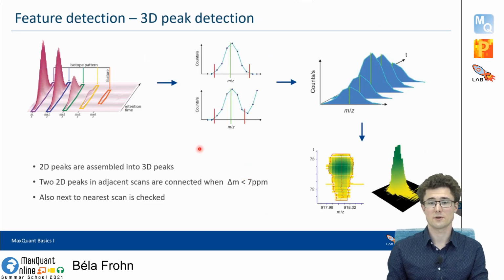So how does it work? This is what we get as input. And now as a first step, we want to find peaks on here, this mass to charge axis. So we have data points on this axis, and they describe something like a peak. And what we basically do is that we define some limits of this peak, which is either between the first 2 data points where one is 0 and the other one is not 0, basically, so these guys here.